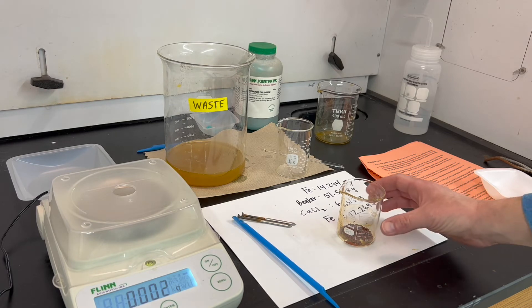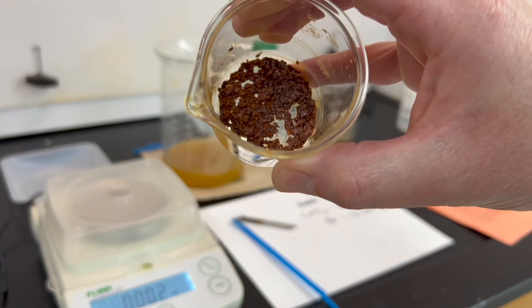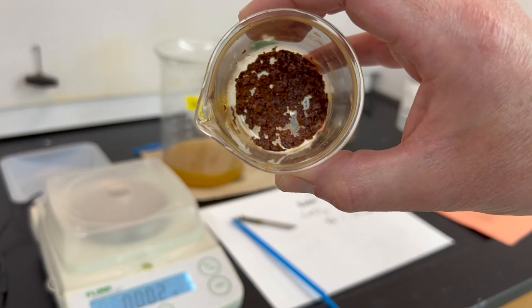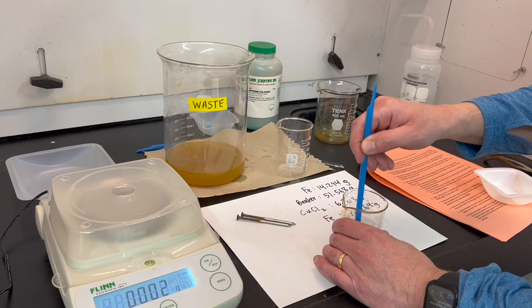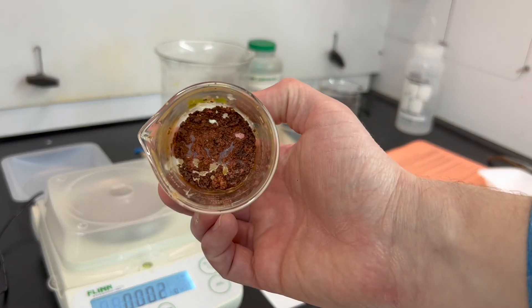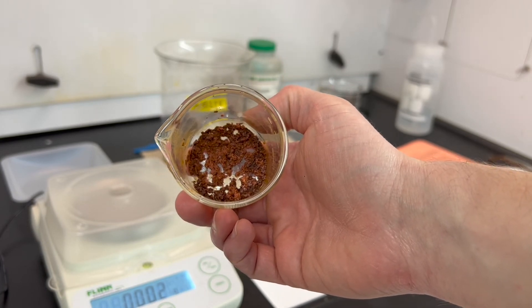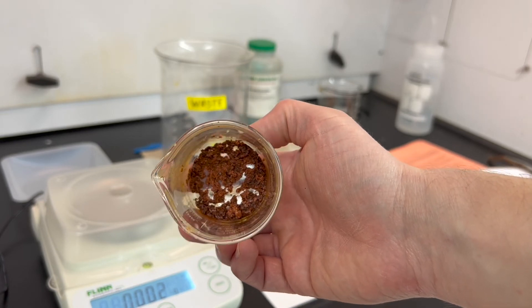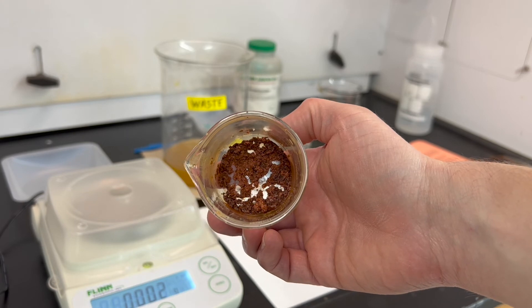The copper beaker has been in the oven for a while, but it still looks like it could be a little wet. Use your spatula to break up the pieces and see how dry it looks. It looks like there's still some moisture, so it may need to air dry overnight. Since it's getting close to the end of the period, go ahead and get a mass measurement now, and then compare that measurement after a day of air drying as well.